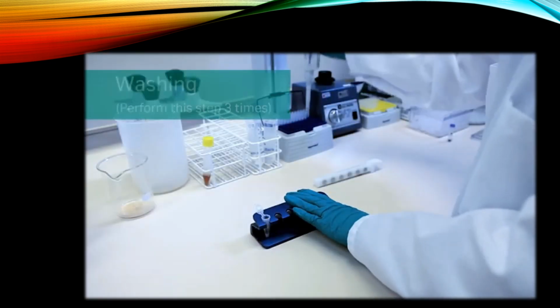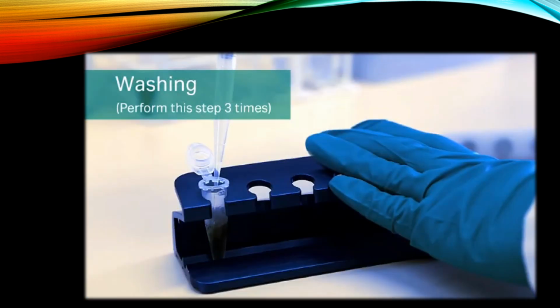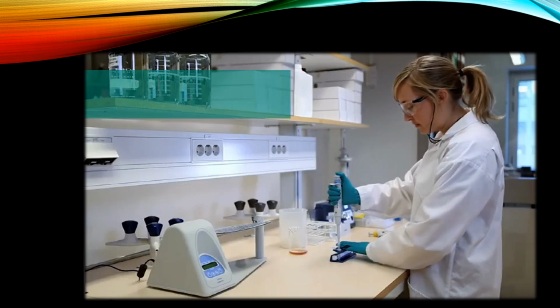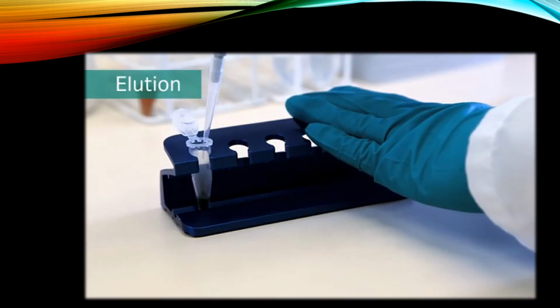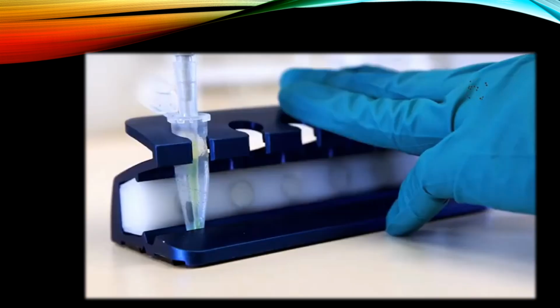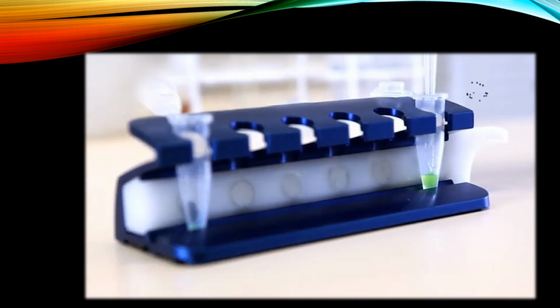Add 500 microliters of binding buffer with 5 to 60 millimolar imidazole to remove unbound proteins. Repeat this step 3 times. Add 100 microliters of elution buffer. Resuspend the medium. Remove and collect the elution fraction. The collected elution fraction contains the purified protein.